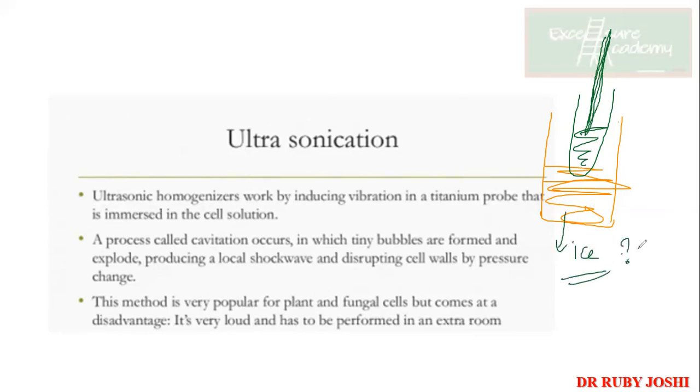Why is ice needed? This process may induce heat, so to maintain the organelles and whatever we want in the suspension intact, we need ice. Yes, very good. Since ultrasonic waves are produced at such a high energy level, they release heat. And if we haven't kept ice, the tube also gets hot, due to which the chances are that the proteins or enzymes you're interested in may get denatured. So that's why we keep it on ice.